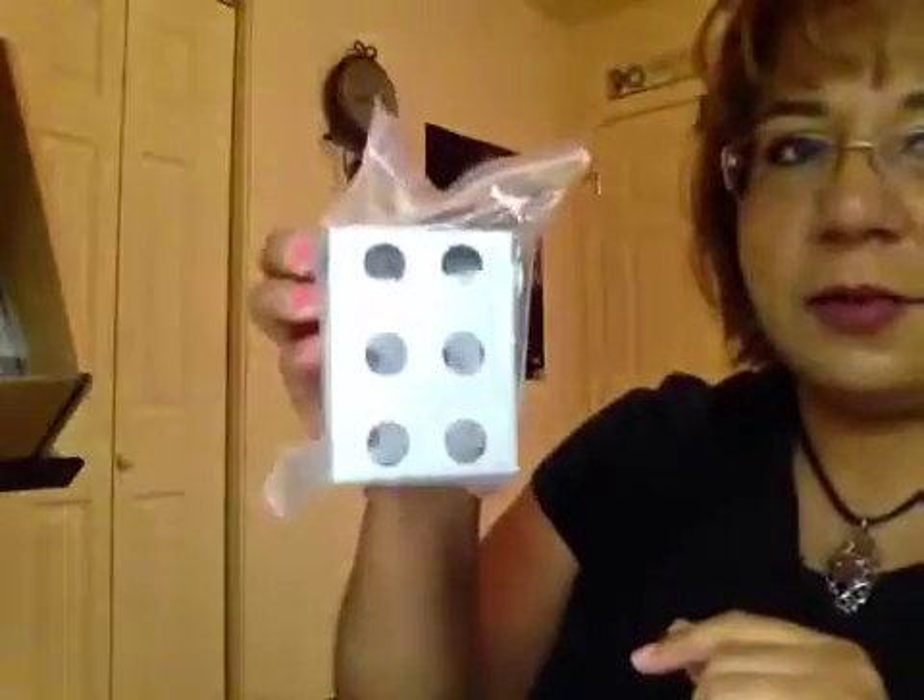A couple other things in your kit: you actually have a small scale — it's what they call a pen scale, a spring scale, right in here. And you do have quite a few pieces of glassware, meaning things made of glass — they're all packed in bubble wrap. Make sure that when you unpack your test tubes you realize they are made of glass, and if they're broken you may need to contact the company for replacement items. This little metal thing — which if it were a little bit bigger, ladies, you might use to hold your lipsticks — but it's actually a test tube rack. So when you're going through your kit, if you're not sure what a test tube rack is, it's this thing with all six holes on the top.